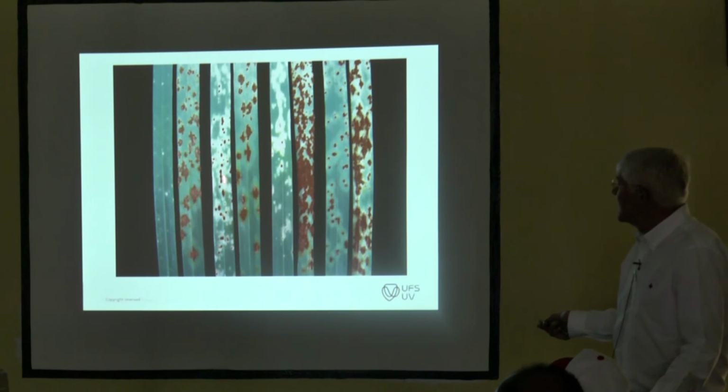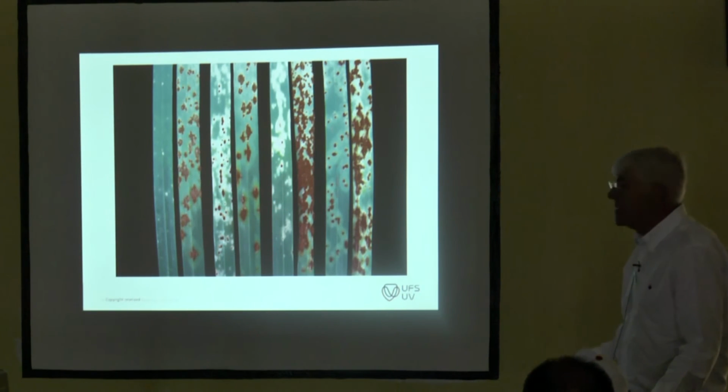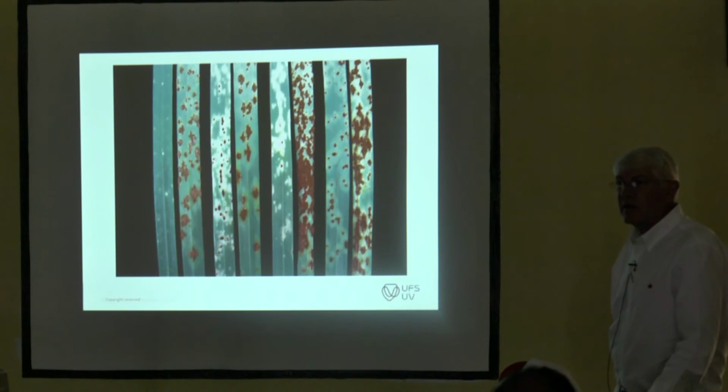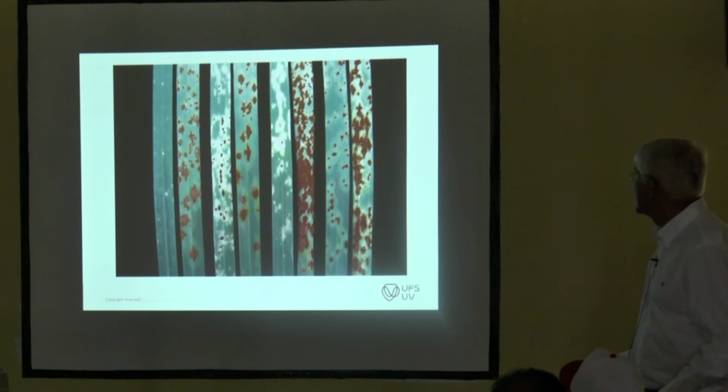What would you call that? I mean, it's low, clearly. If you would like, you'd probably give it an X, and probably an X minus or X double minus, because the majority of the pustules are smaller. That one? It's low. It's probably a fleck 1C, even an N if you want. There's a lot of chlorotic and necrotic tissue.